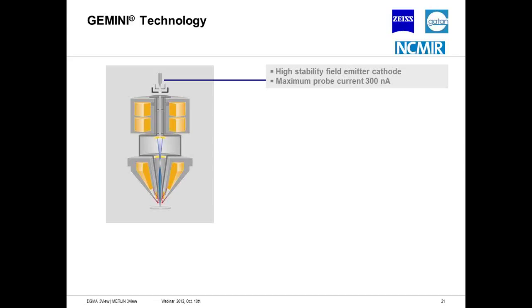It's a big difference for you if you run a sample overnight or if you run it for weeks or for months. So to speed up the imaging and the scanning of the sample is an absolutely important thing.